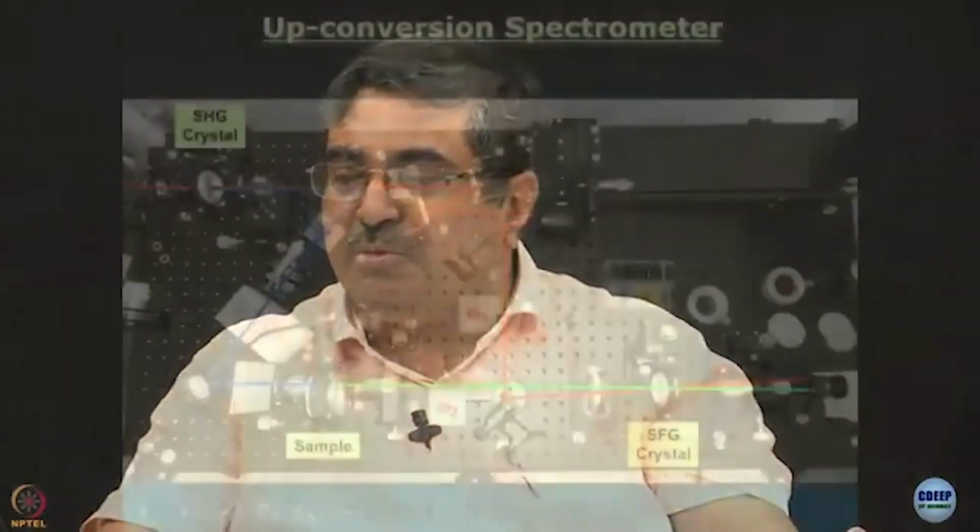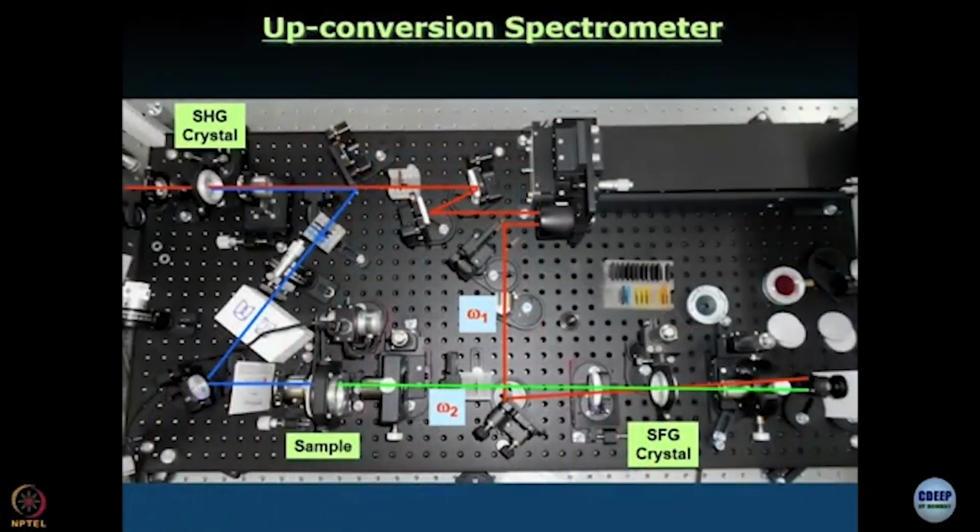What about omega 2? If I look at it in the time domain, what is the time evolution of omega 2? It is from fluorescence, right. So, it is a decay. This is a point that we are going to come back to shortly. But before that, let us think in a little simpler manner, not worrying about time at the moment.